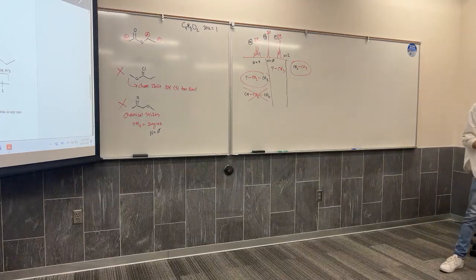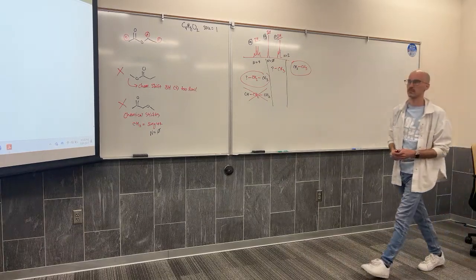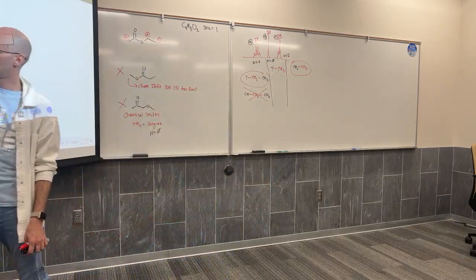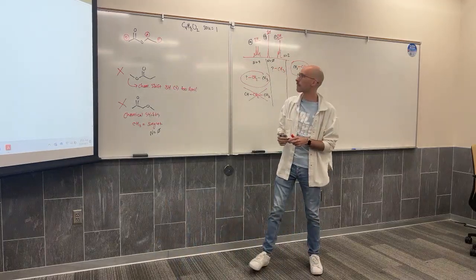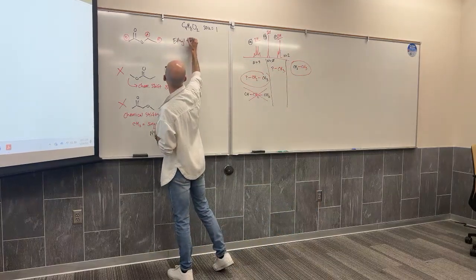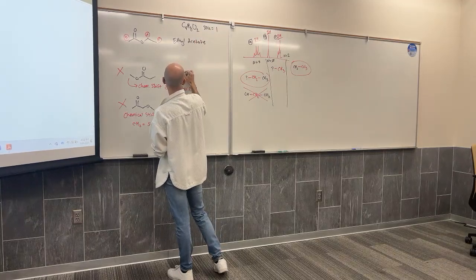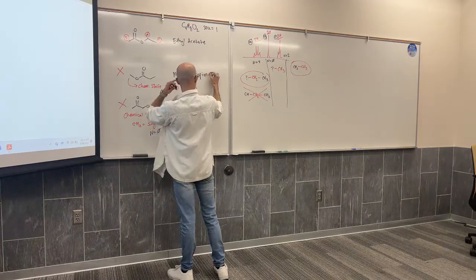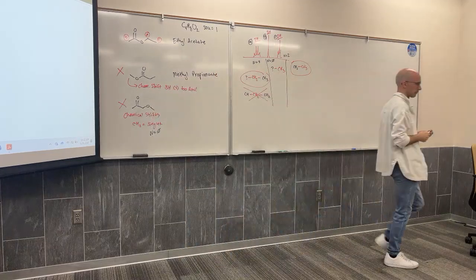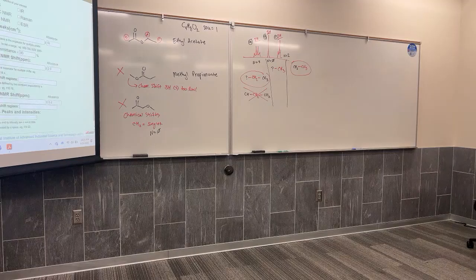That's our compound right there. Let's prove it. I'll zoom out. CH3, signal B, CH2, signal A, CH3, signal C. This is ethyl acetate. Let's look at methyl propanoate, which is that other molecule that we were looking at, the other structural isomer that we were debating.